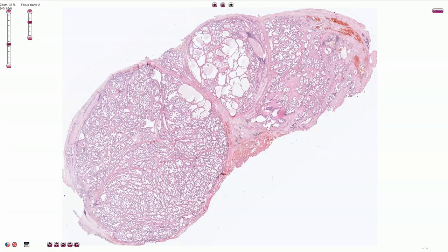This is the slide with the nodular hyperplasia of the prostate gland, also called benign prostatic hypertrophy. It is a very common disease — actually it is so common that it is almost considered a norm. The incidence increases with age. The reported incidence is about 20% at the age of 40, 50% at the age of 50, and about 70% at the age of 60.